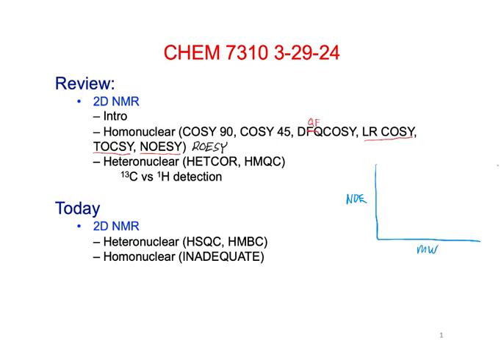It's not really the molecular weight, it's how it tumbles in space, but it's generally related to the size of the molecule. If they're smaller, then we get positive NOEs, like we've been seeing. We call it an NOE enhancement.